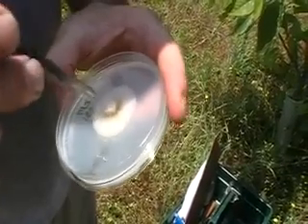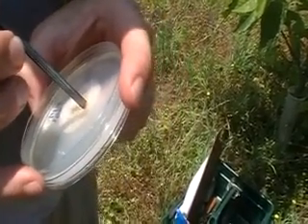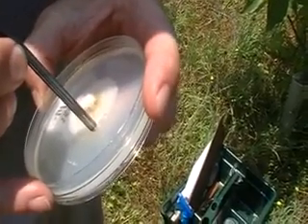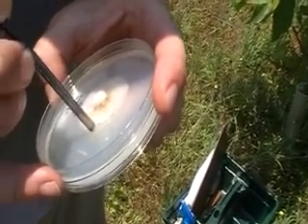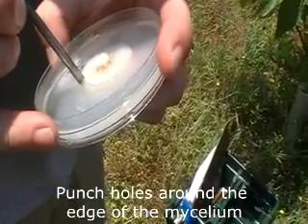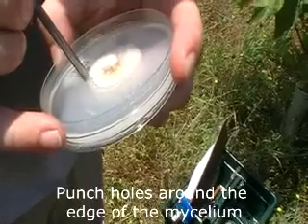Sticking in the auger to make sure it's cool. Then you want to go right around the very edge of the plate, right around the very edge of the mycelium growth.